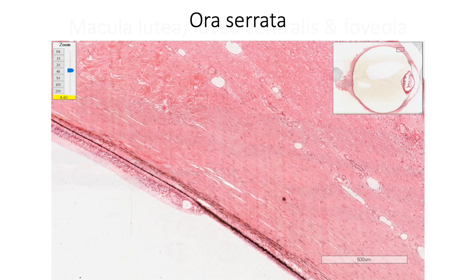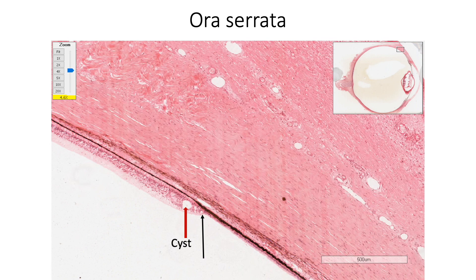At the ora serrata, the ten layers of retina are reduced to only two layers. The outer retinal pigment epithelium continues as the pigment epithelium of the ciliary body, while the inner nine layers of the neural retina are reduced to a single layer of non-pigmented epithelium of the ciliary body. Cysts in the neural retina close to the ora serrata can also be seen.